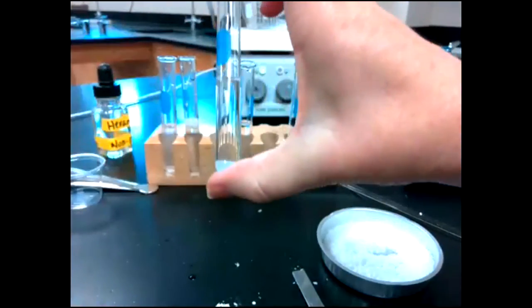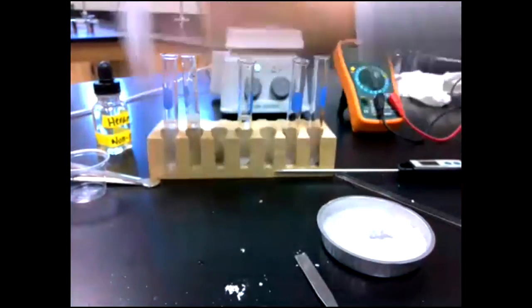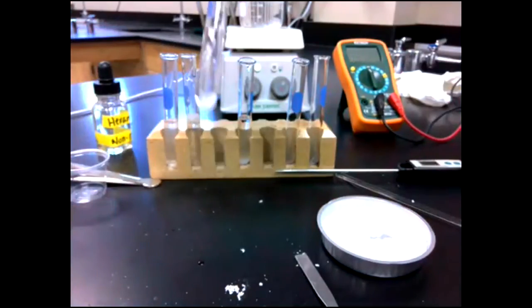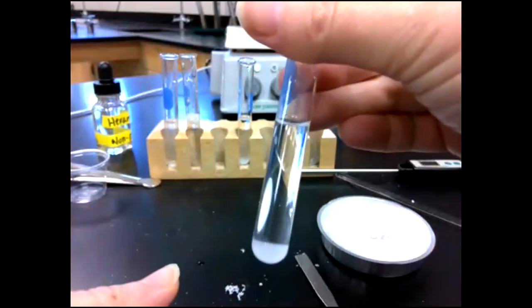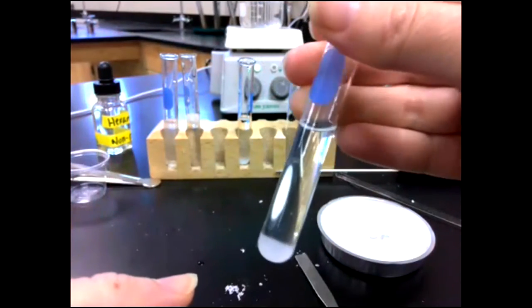I'm going to wash my hand. I'm just going to seal it off with my fingers and then wash my hands after. And again, this also evaporates kind of like gasoline, so I have to work pretty quickly. If I wait long enough, it will all evaporate. And so that is A, and I don't know if you can tell, it's definitely not soluble. It hasn't gone anywhere. It sinks to the bottom, does not float.